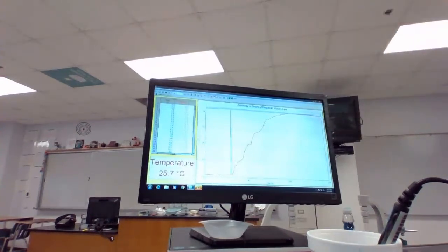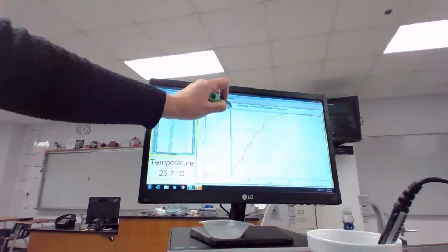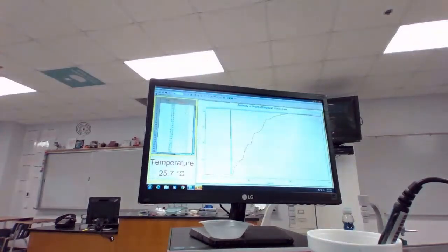And what we're looking for is, well, what temperature is actually the highest temperature that we attained? And so I know that we can look for the highest temperature that the laboratory got to by scrolling down here, because the highest temperature our laboratory got to was 29.6. And this might actually be at 29.6.